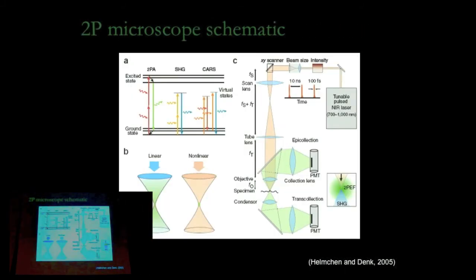Okay, so infrared illumination doesn't scatter as much. It'll penetrate deeper into the tissue. It can be useful for imaging into cortex through cranial windows. You can use it in tissue slices to look at dendritic spines.